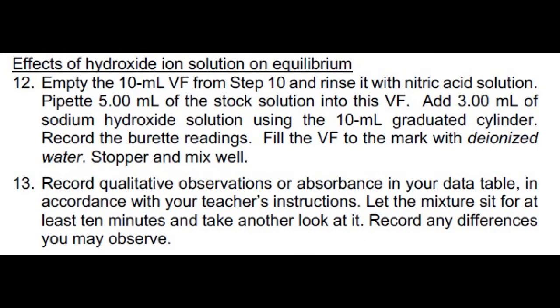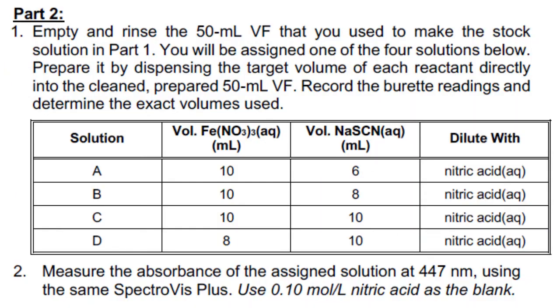Steps 12 to 13 refer to the addition of sodium hydroxide to your solution. Follow the procedure as written and record your observations.